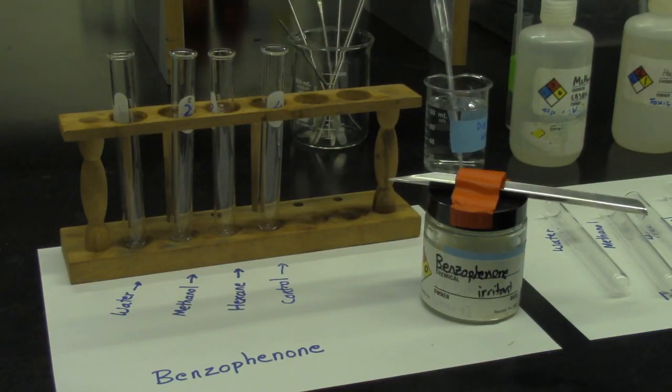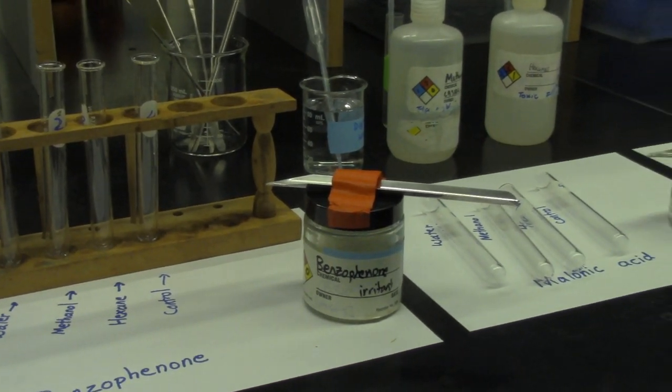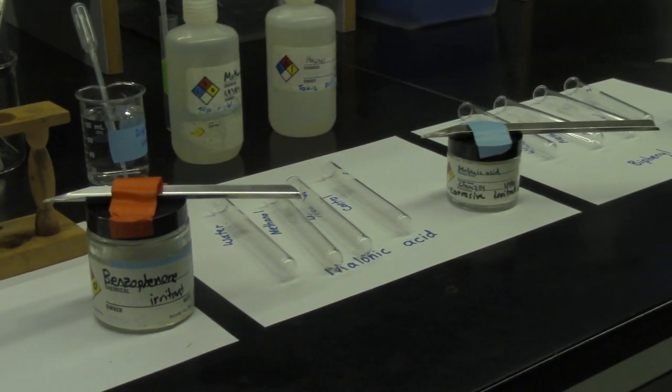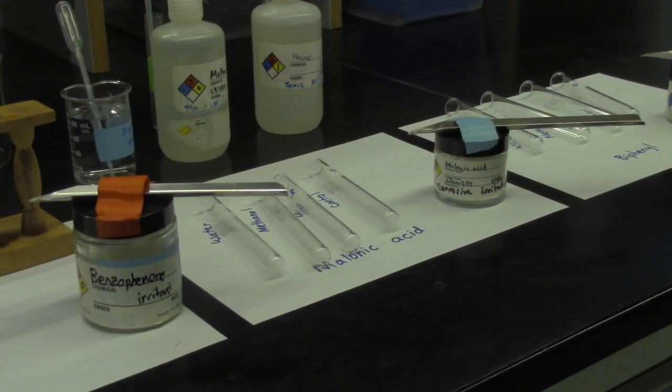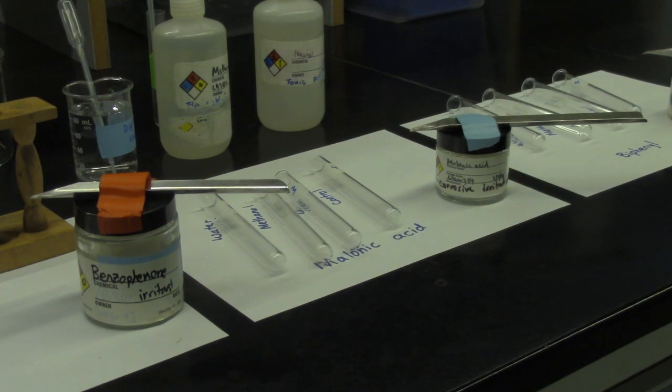So in part A of solubility, you will determine, for 3 different compounds in 3 different solutions, whether they are soluble or partially soluble or insoluble. We have benzophenone, malonic acid, and biphenyl, using 3 solutions: water, methanol, and hexane.